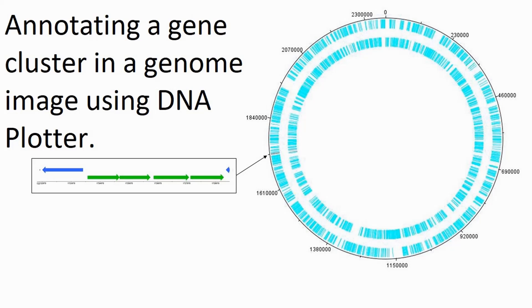I'm going to do a quick update on using DNA Plotter and I'm going to run through preparing an annotation from a selected part of a circular bacterial genome.